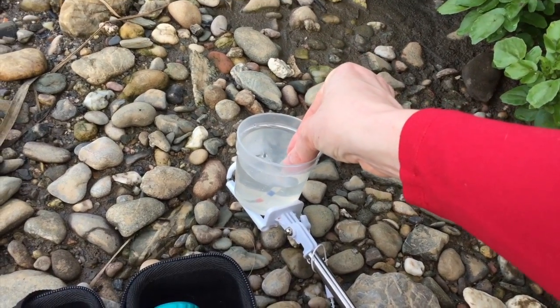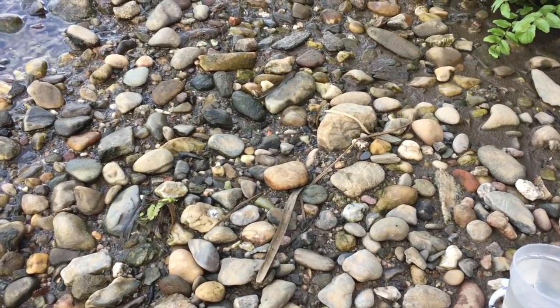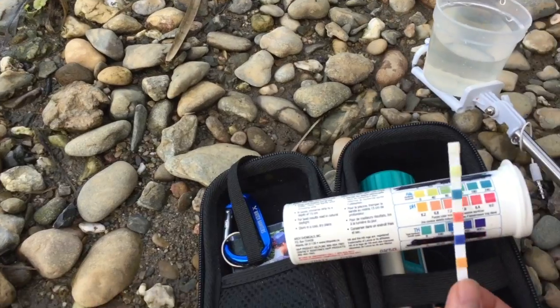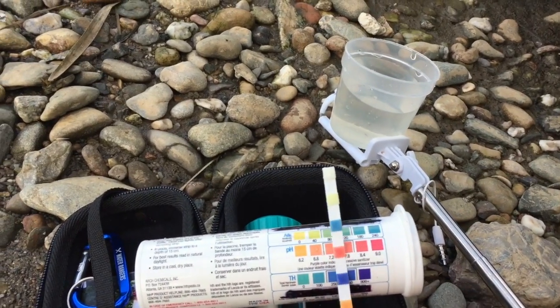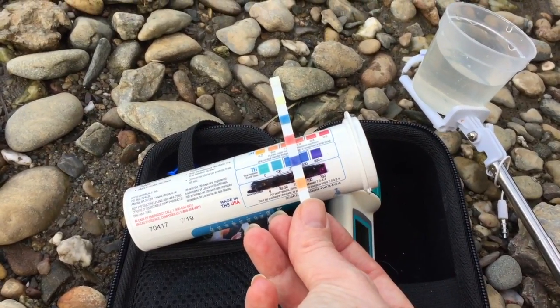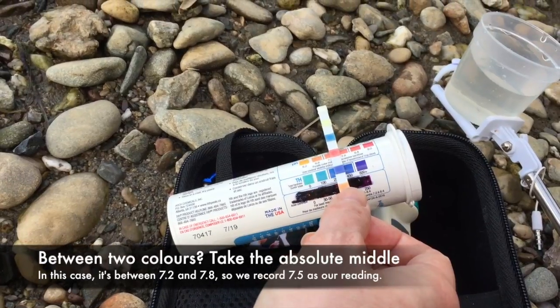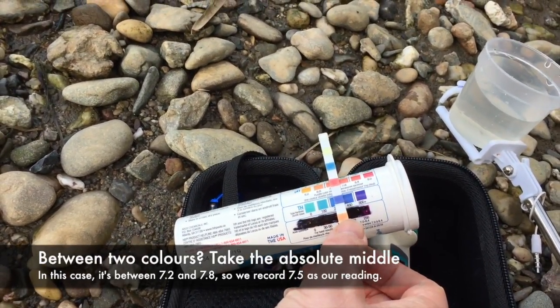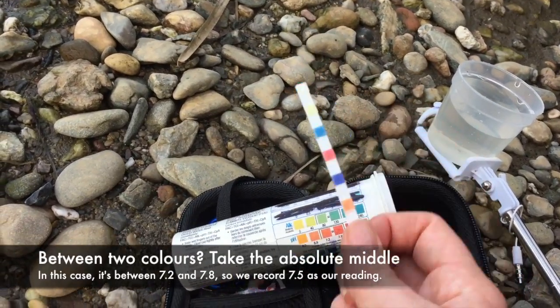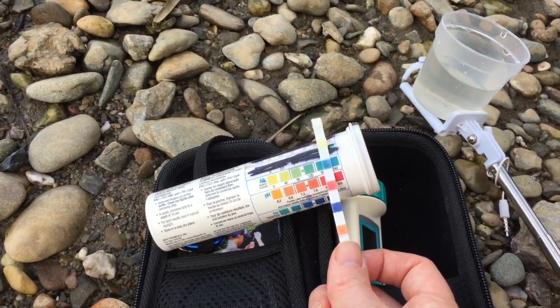Dip in for two seconds, then compare. We compare vertically on the strip here. I'd say about 450 for hardness, right in the middle of 7.2 and 7.8 for pH. And the last one we do is alkalinity — it's quite high.